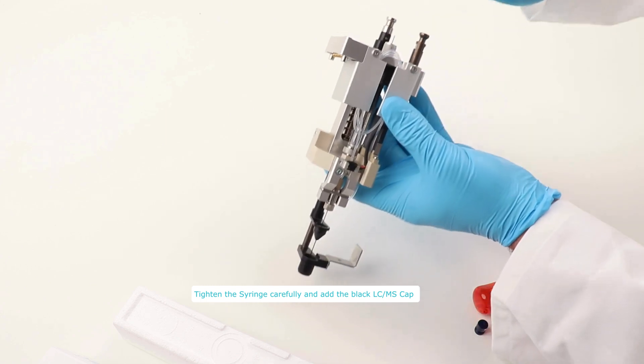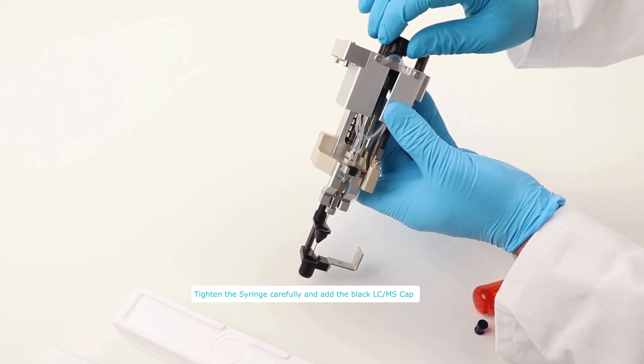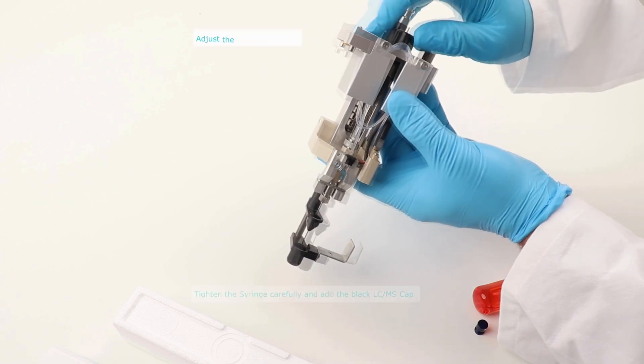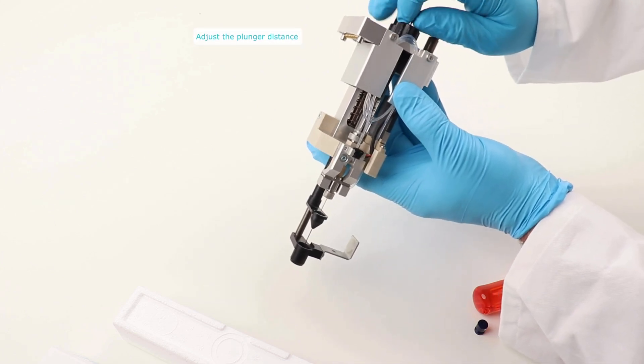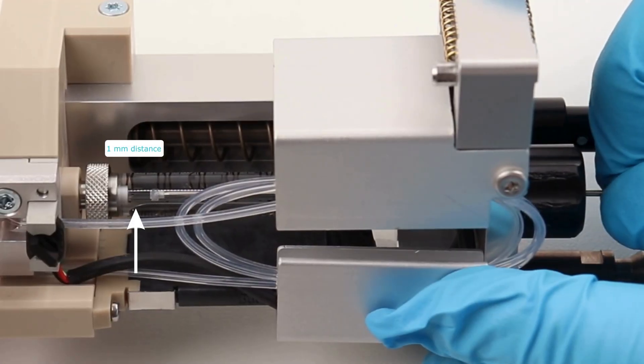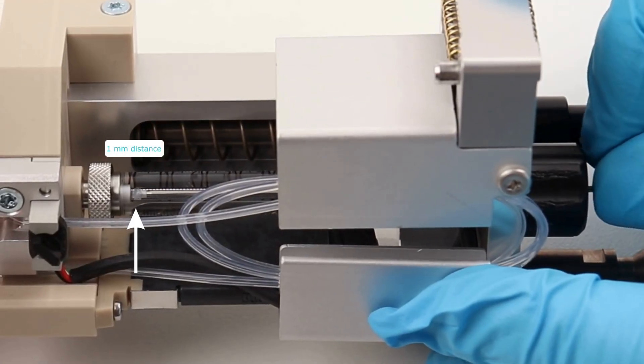Now, place the black cap onto the tool and tighten it as well. Adjust the distance of the plunger inside the new syringe with your fingers. Ideally, the distance of the plunger from the needle is 1 mm, as highlighted here.